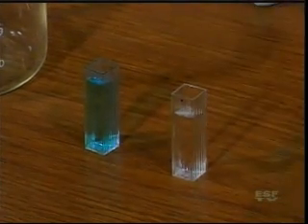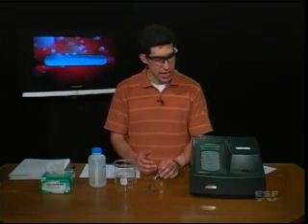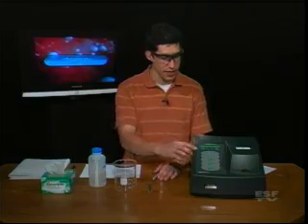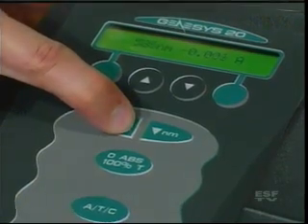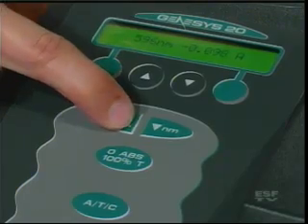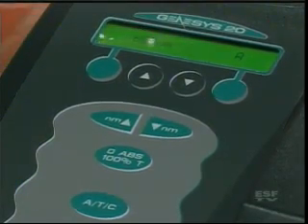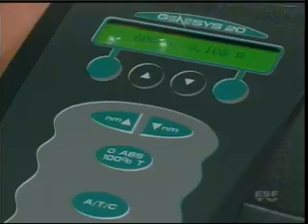The next thing we have to do is set the wavelength. What wavelength are we interested in finding out about? That may be told to you in your lab procedure, or your TA may tell you, or you may have to figure it out. In this case, the absorbance we're interested in is at a wavelength of 600 nanometers. So I'm just going to use the nanometers up button and adjust it to 600 nanometers, and I'm going to insert my blank cuvette.